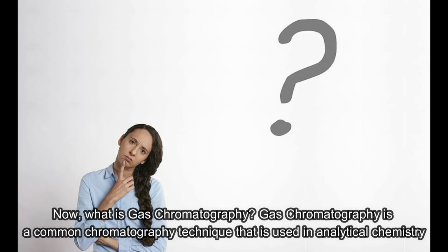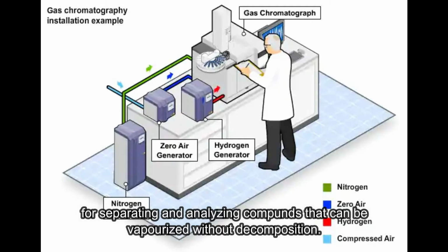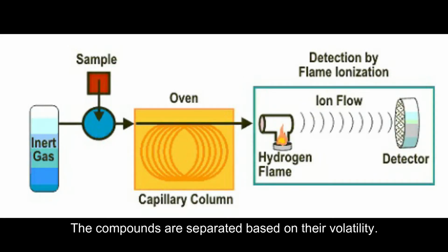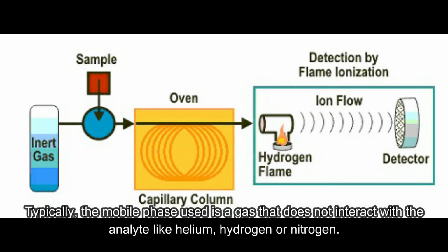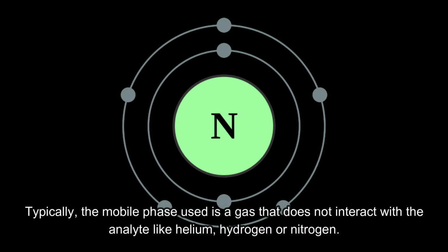Gas chromatography is a common chromatography technique that is used in analytical chemistry for separating and analyzing compounds that can be vaporized without decomposition. The compounds are separated based on their volatility. Typically, the mobile phase used is a gas that does not interact with the analyte, like helium, hydrogen, or nitrogen.